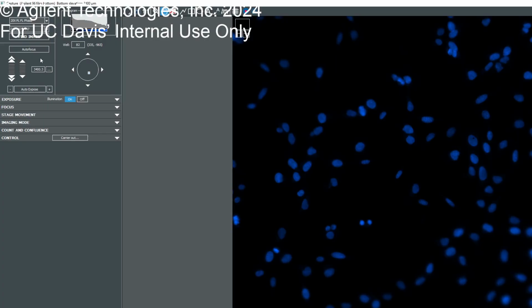So again, click on auto expose and autofocus. So the point I was trying to make is, now that square is gonna be significantly smaller because this is just the FOV you are in. Yeah, that doesn't help me. I want to click this arrow and I click that circle and then my square goes into the wrong place and I have to restart my account.